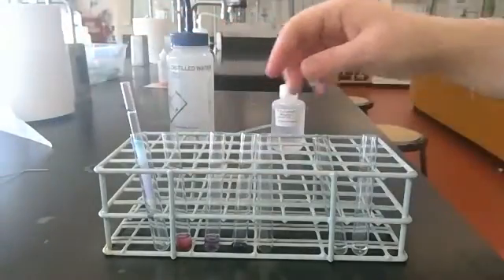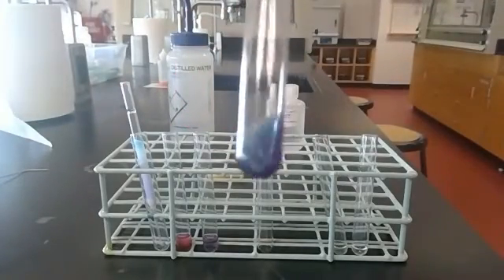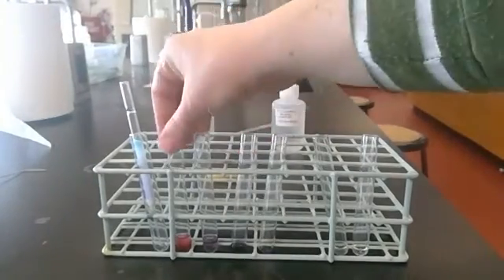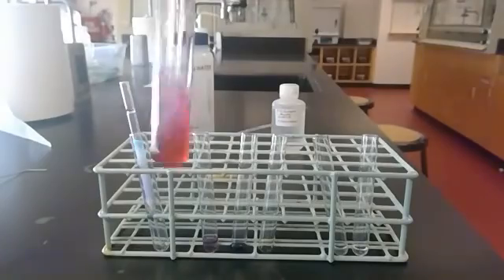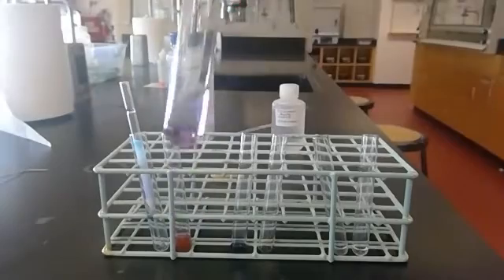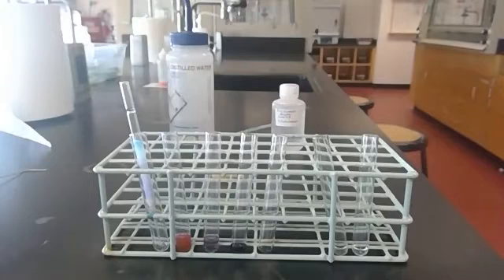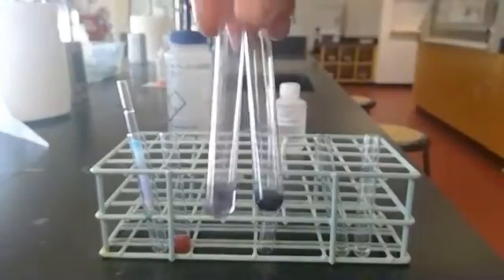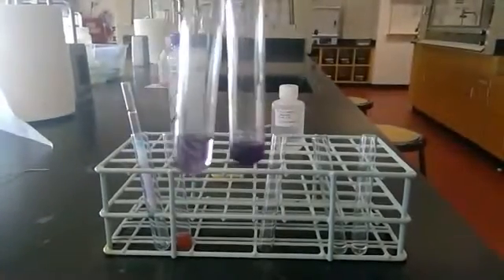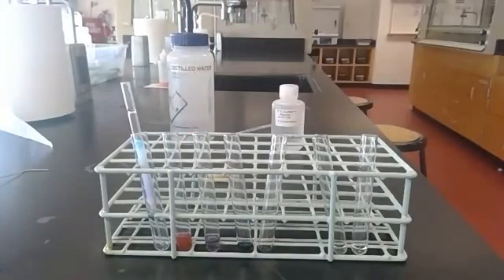I'll stop there. So here we have our first color that came out was blue. And the second color that came out when we added the water was red. In between the two, our second fraction of isopropanol was a reddish purple. So just using a polar stationary phase with a less polar mobile phase, we were able to have a blue color come out first, followed by, I don't know if you can see it very well, let me get a piece of paper, followed by like a reddish purple.